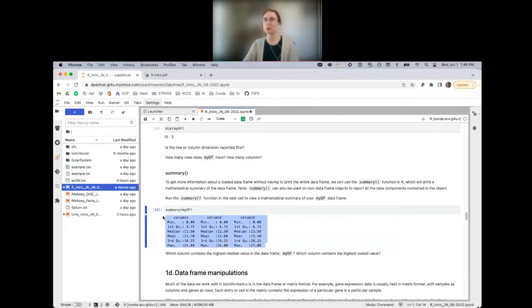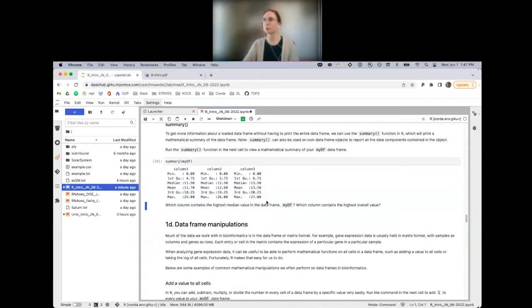Is anyone not getting this output when you run summary? Perfect. Okay. Thank you. All right. Great job, everyone.